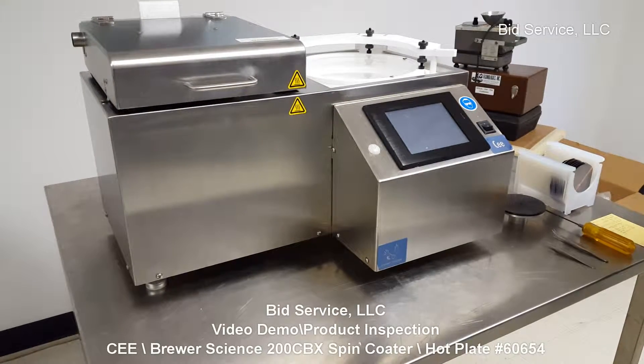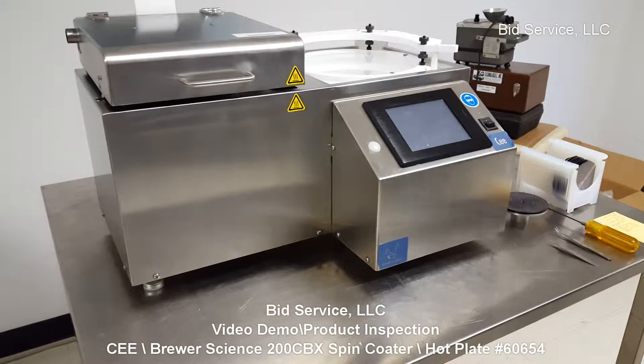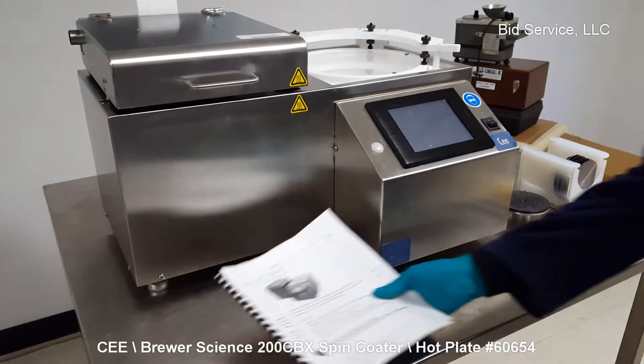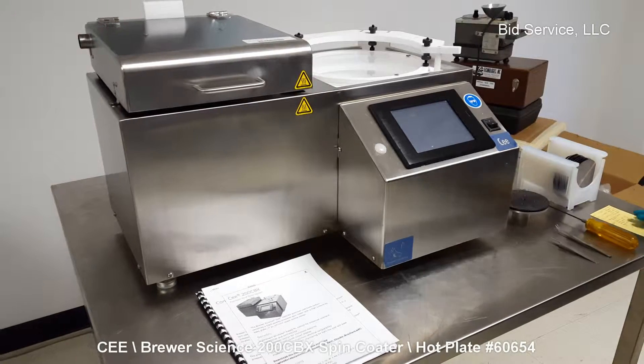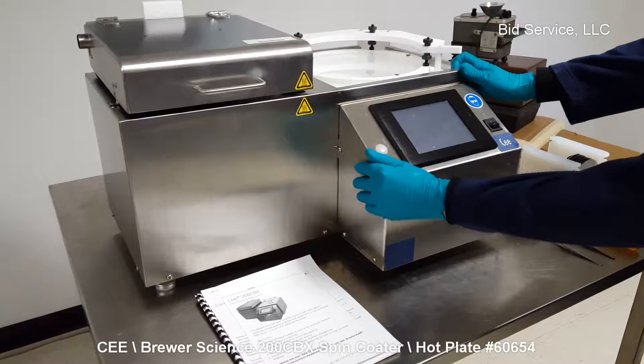This is the C model 200CBX combination spinner and hot plate station, manufactured by Brewer Scientific. It is a convenient station that is clean room suitable.